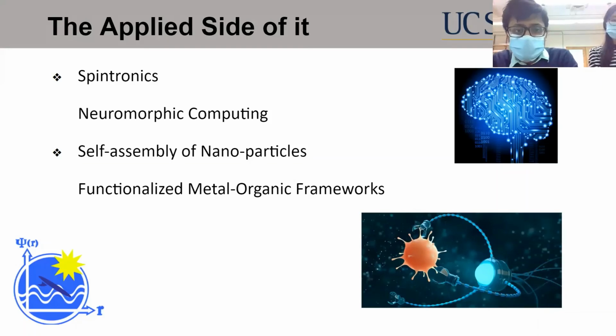We are also developing new things with metal organic frameworks where we change a particle inside a virus and control the virus, so that becomes a functionalized virus. We just use it as a carrier. So we load it with some information to deliver, or medicine to deliver at a particular cell we want, and deliver it there.